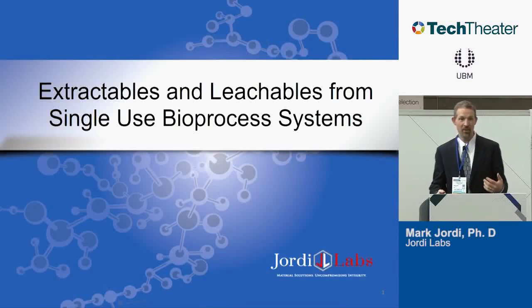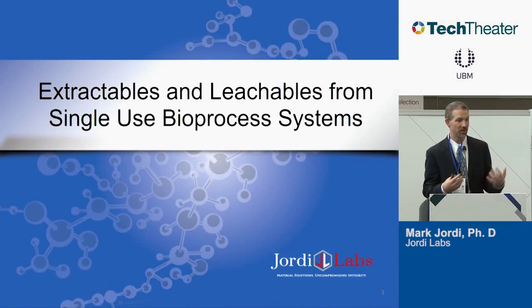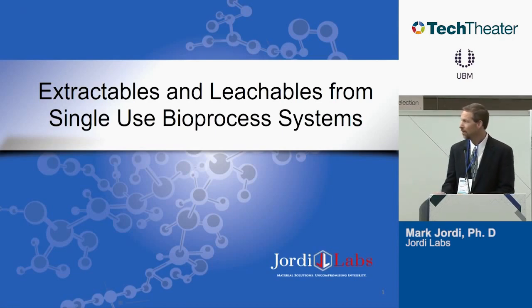Today I'm going to be talking to you about extractables and leachables and a study we performed on a single-use bioprocess system where we're going to examine its extractables and leachables. But really the goal of my talk is to give an overview of how this process is conducted and some of the unique ways that we do this at Jordi Labs.